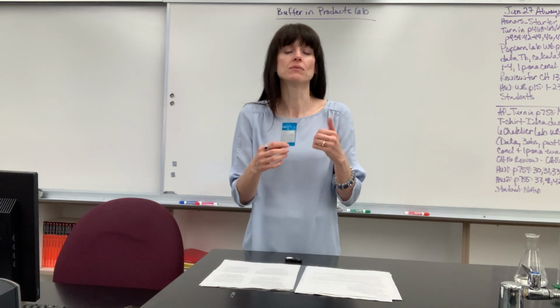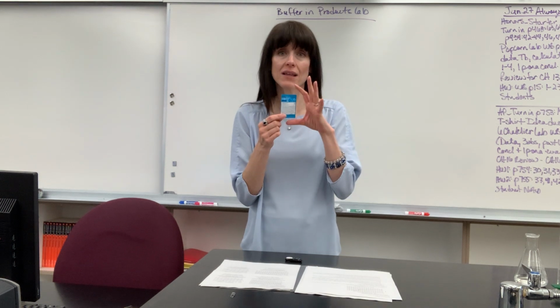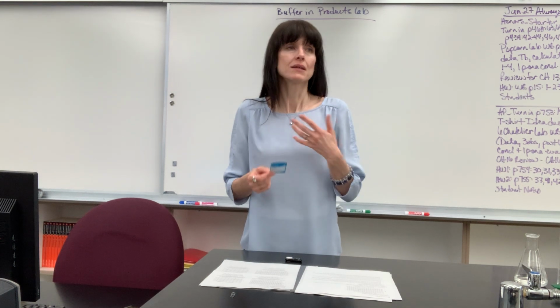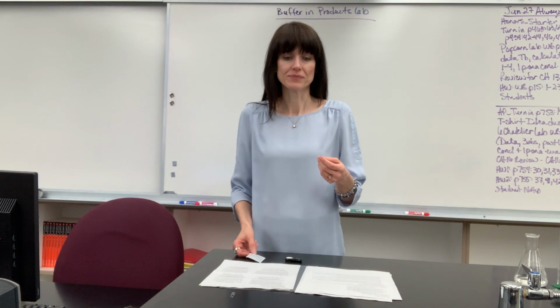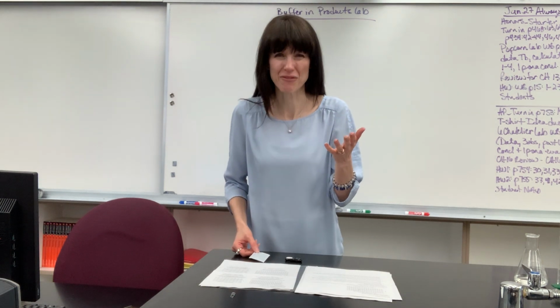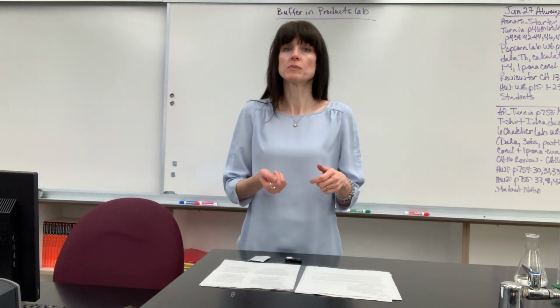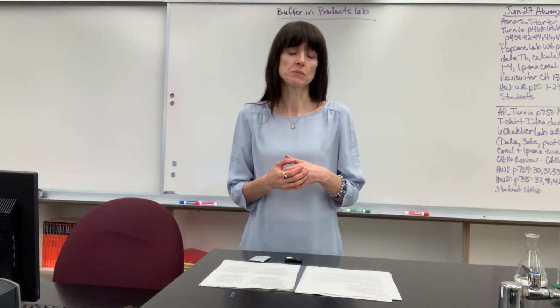So here's your first task. Whatever you're given, you have to make it into a solution. So honestly, I would make the Alka-Seltzer according to the directions because that's what we consume. Let's say that you're given tomato paste. Well, that's a smushy solid, for lack of a better word. You are going to take a tablespoon and dissolve it in at least 50 mils of water.